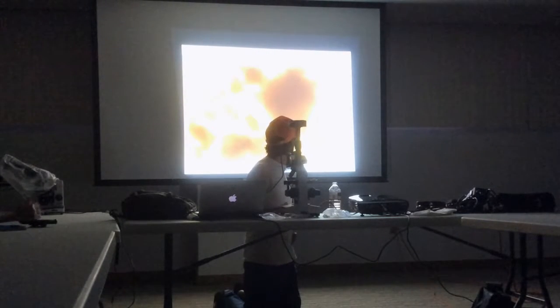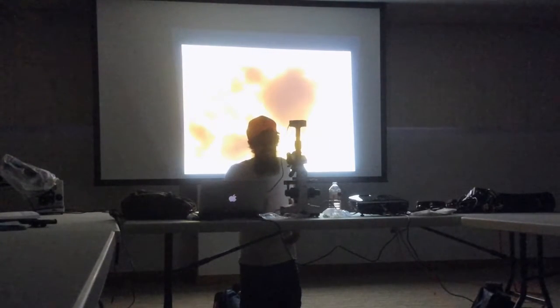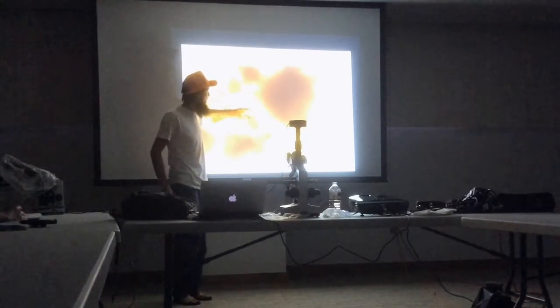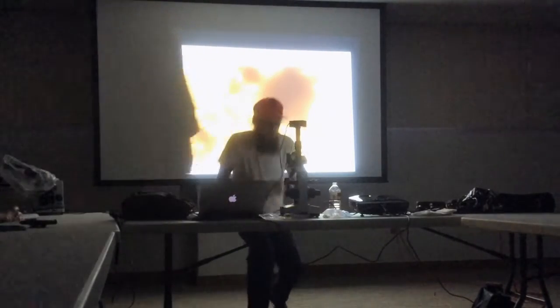So what is that? Yeast? Yeah, it's a yeast, right? You see how it's budding? They're budding on each other. These two, those are yeast right there, and then that might be the fungus.